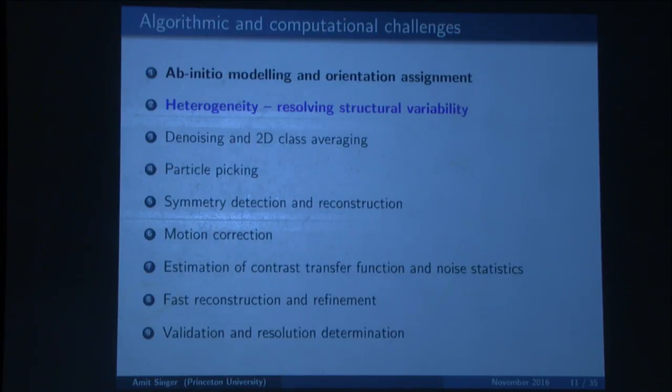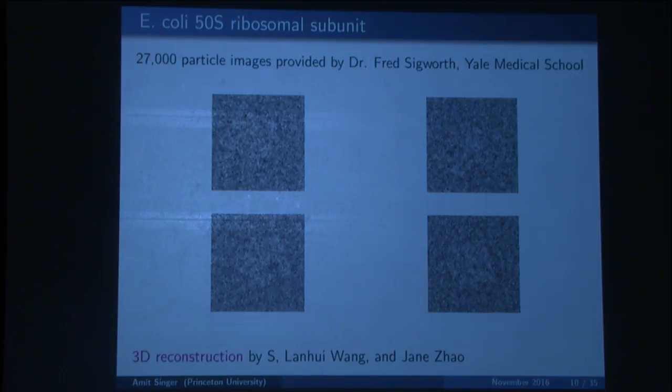But anyway, the cryo-EM that you used gave similar, better? Similar results, yeah, because it's using old detectors. With the new detectors, you can get much higher resolution. Very good.